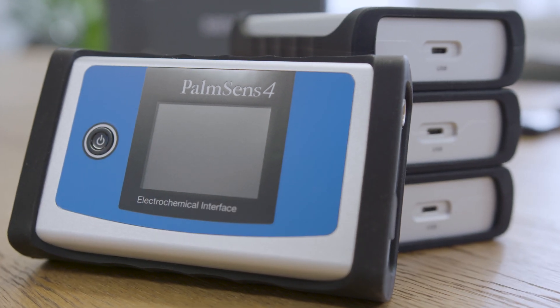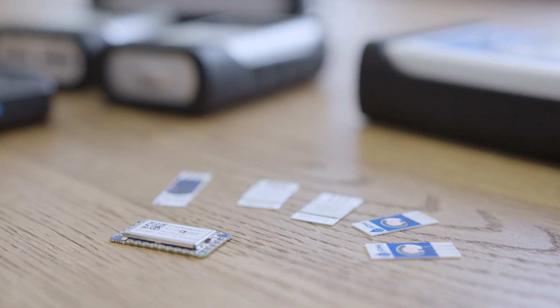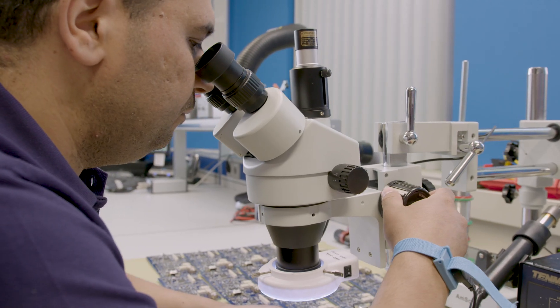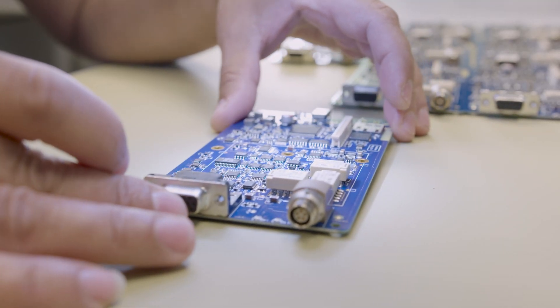Electrochemical sensors provide opportunities for many different markets. However, many of these opportunities do not find their way because of the complexities involved. A compact and ready-to-go measurement solution can be the answer.